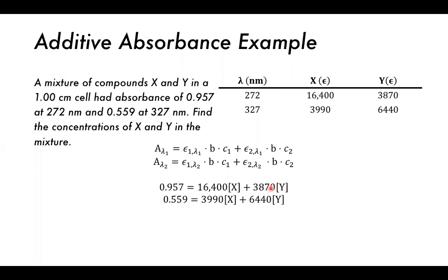And then the second equation, at wavelength number 2, which is 327 nanometers.